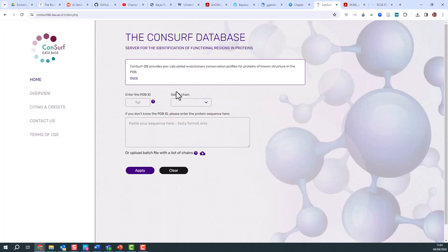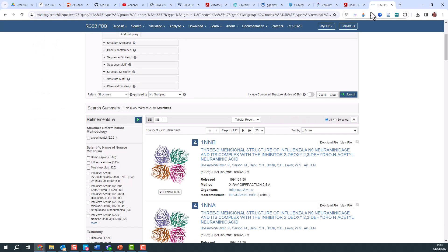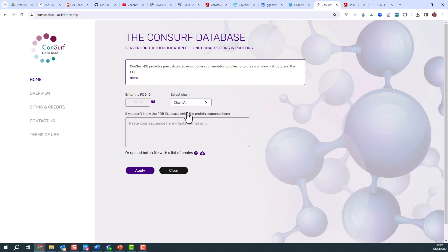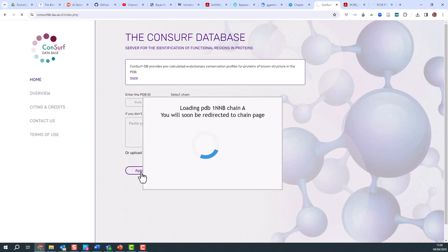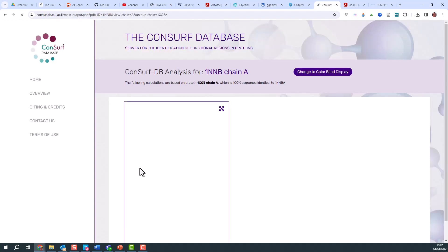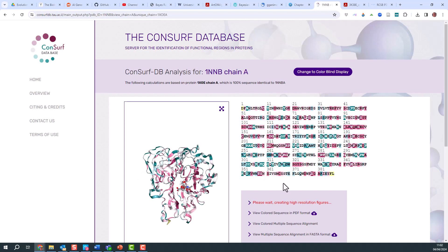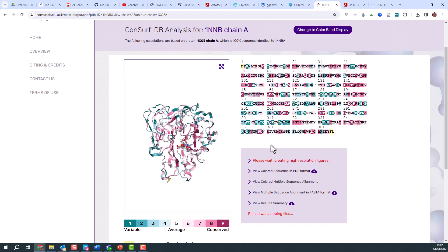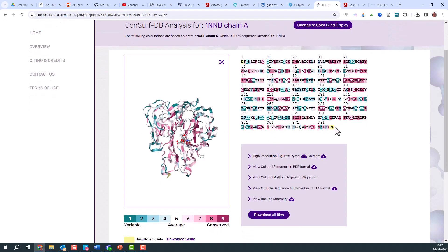If I go into CONSURF, the CONSURF database, I can put in the name of that particular structure, which is 1NNB. I'll wait for it to do the search. I'll use chain A. It's going to reload that particular sequence.